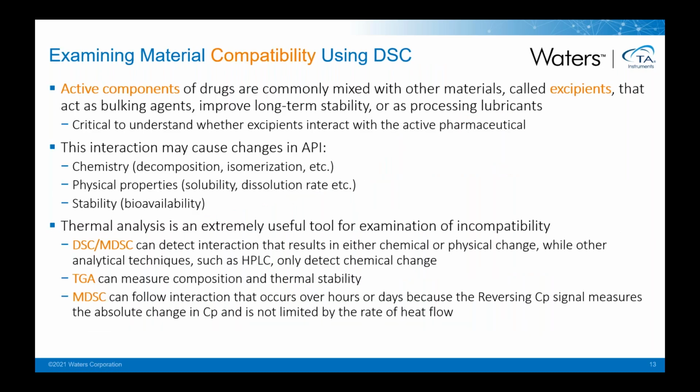So that kind of moves me to another type of materials that we would commonly test, and this is more suited for the pharmaceutical type materials. But looking at material compatibility using the DSC, it is certainly a tool that can be used.